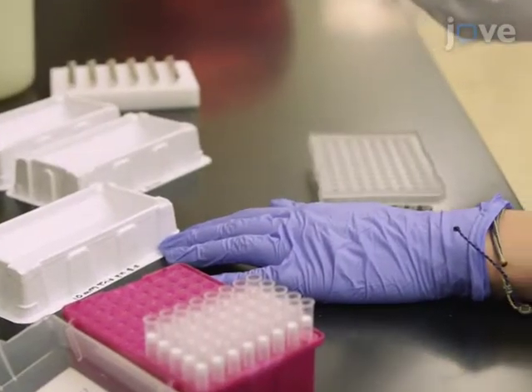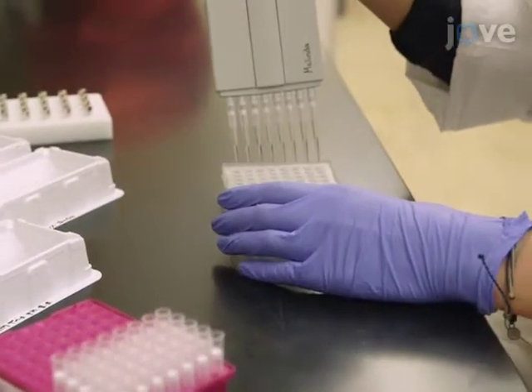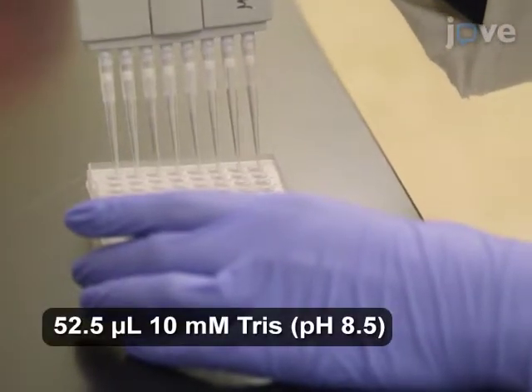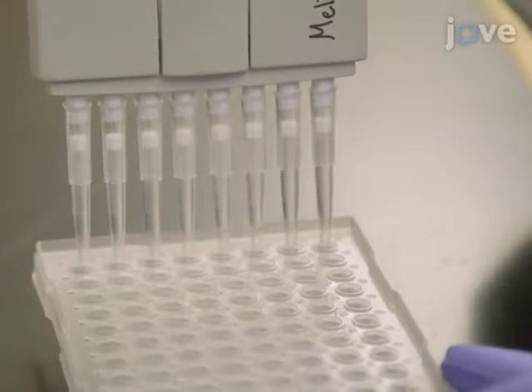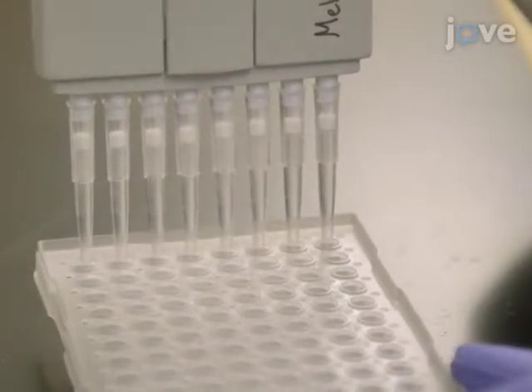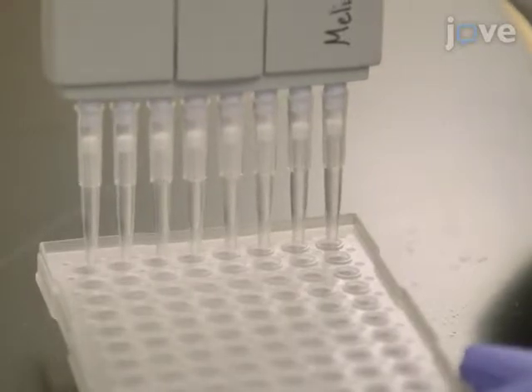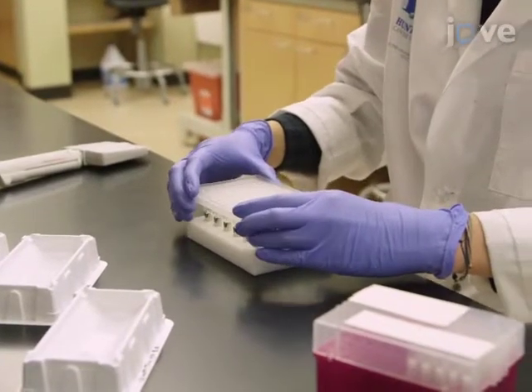Now, elute the reaction products from the beads by removing the plate from the magnetic stand and adding 52.5 microliters of tris to each well. Completely mix the beads into solution by pipetting the entire volume slowly 10 times. Then collect the beads on the magnetic stand as before and transfer 50 microliters of the supernatant to a clean PCR plate.